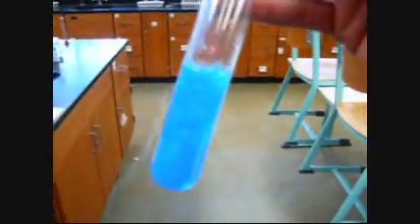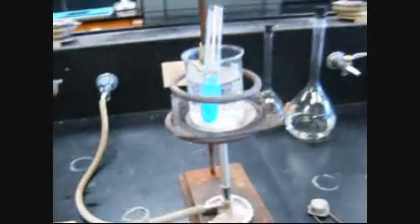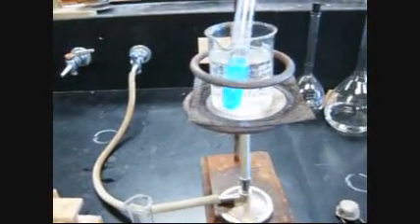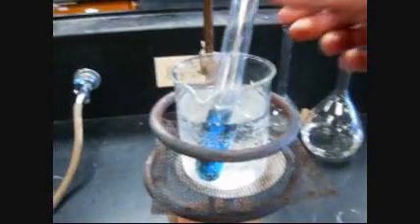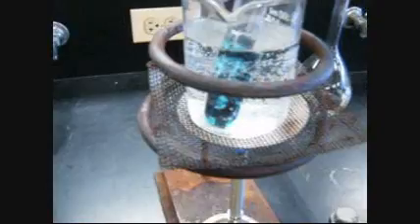And now we'll see what happens in the second reaction. For the second reaction we're actually just going to heat this stuff up in a hot water bath for a while. So we're going to just let this heat up, so we'll leave it for a few minutes here. Okay, we notice a change taking place here already. As this heats up, we see a color change. Some of the blue solid turning to black. Alright, we're going to let that continue to heat up in the test tube here.